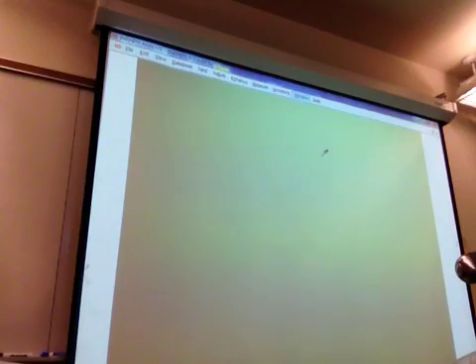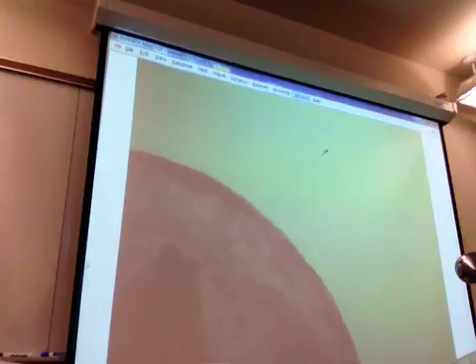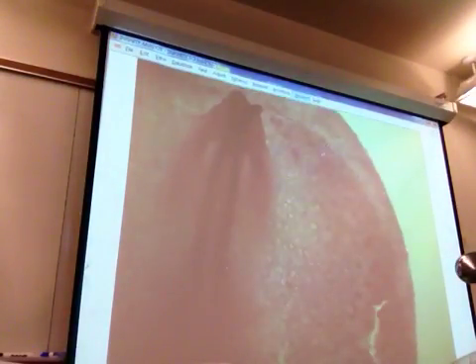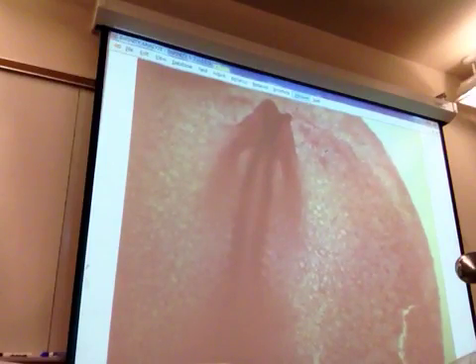Is a neural groove and the neural tube the same thing? The groove forms before the tube, but yes, the groove eventually turns into a tube. So here you can see the somites a little bit more clearly. All these little bumps are somites.